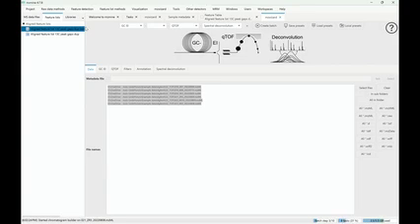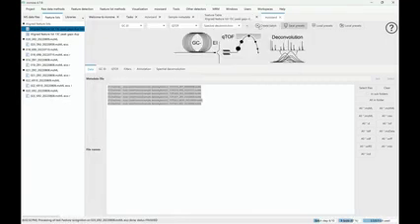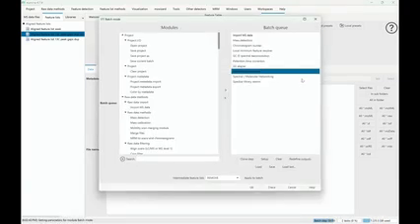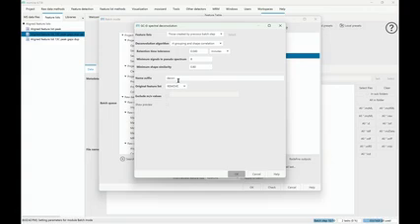We have a lot of fragmentation that we have to take care of, and in the batch, you're going to see that because the wizard actually defines GC-EI QTOF deconvolution. Deconvolution is now the workflow. You're going to see that in the batch that is generated, there is also the spectral deconvolution happening, right? And then here we're going to produce results.